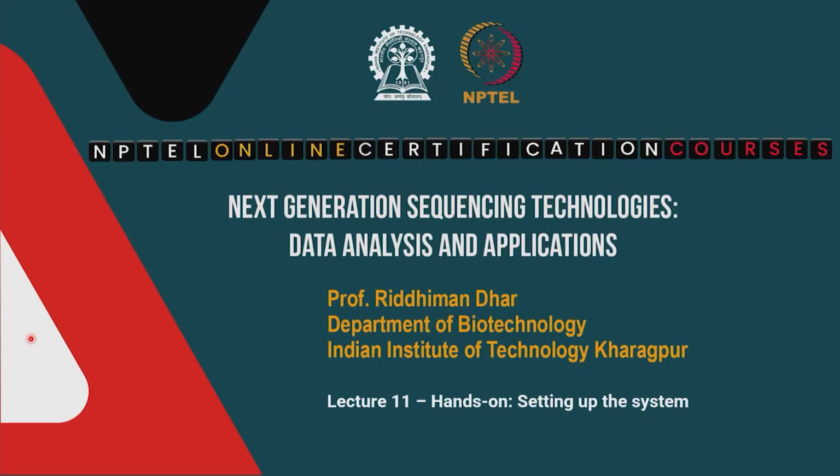Good day everyone, welcome to the course on next generation sequencing technologies, data analysis and applications. We have so far discussed the data formats and we have talked about the quality control, right. So, what we are going to do now is go into the hands on process and actually do those tasks ourselves, okay, with a real data set. So, this is the topic that we will be discussing today, right.